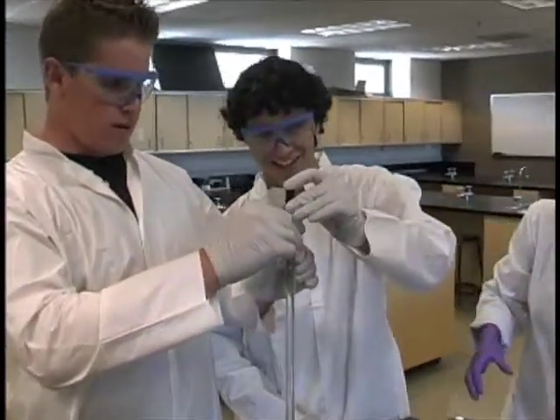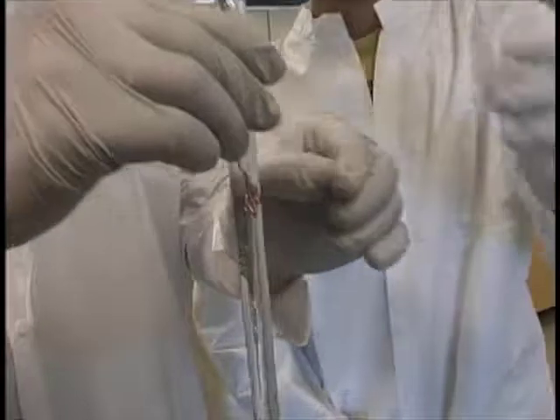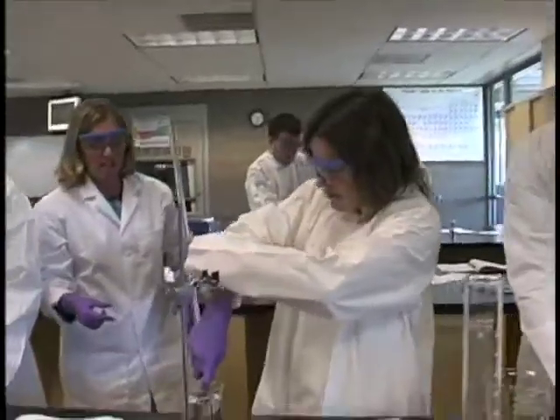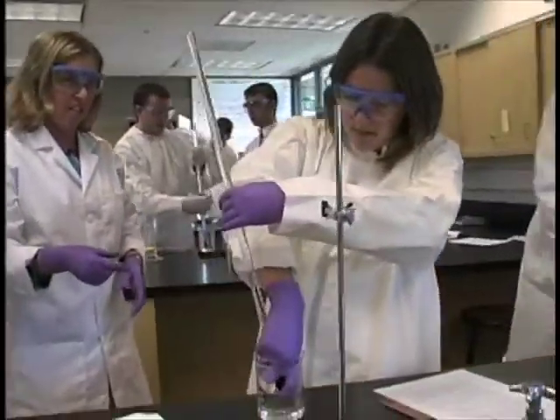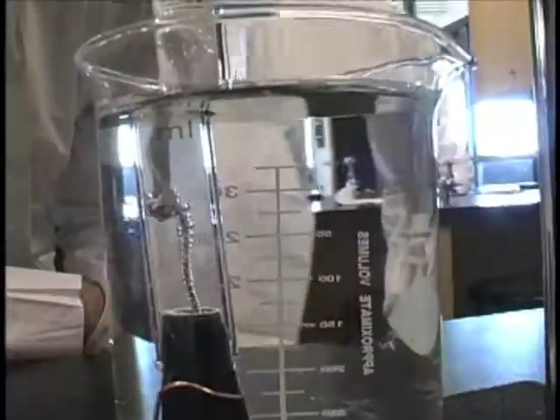There you go, all the way. So it's got to go into the 400 mil beaker. It's not so easy. Okay, you guys have a little air bubble — you're going to be all right. And it's going to start reacting. You're going to see a lot of bubbles.